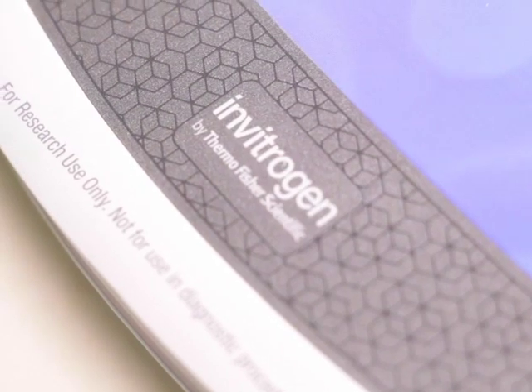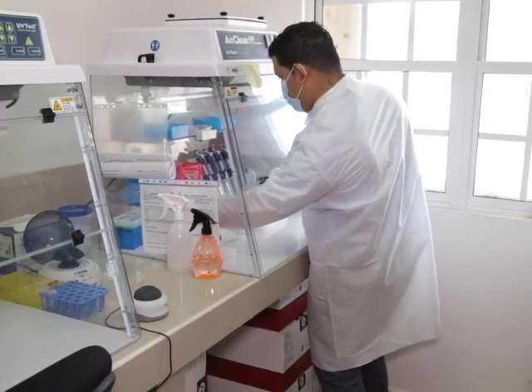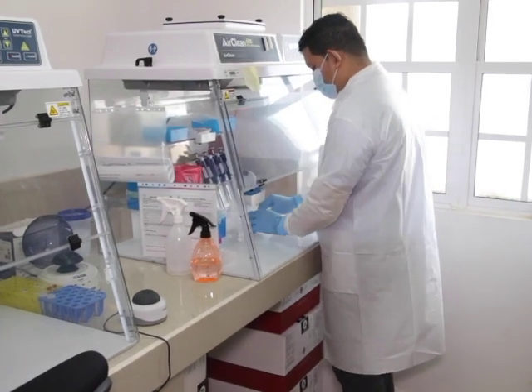Nanopore technology has different kits that can be used. The kit that we're implementing has a lifespan of approximately 4 runs. So within those kits, those are also costs. They'll put a load on the budgeting. The central lab currently has 5 of these kits on hand.